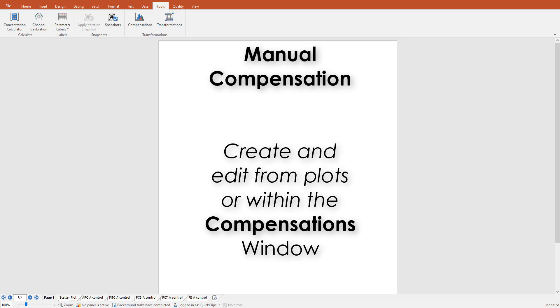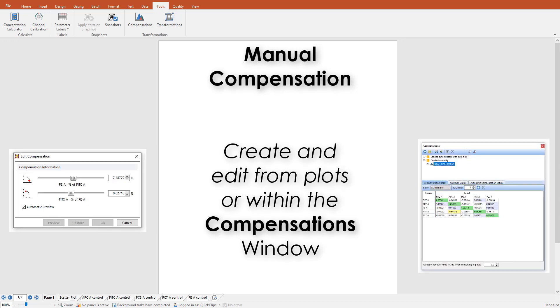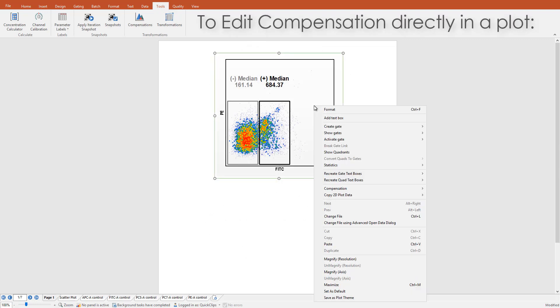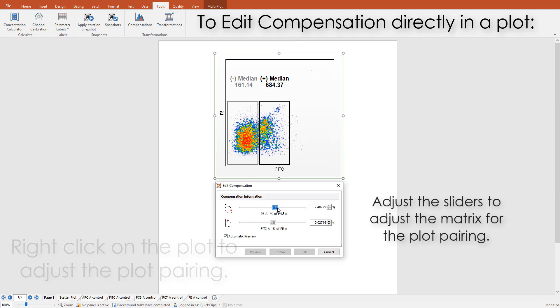A new or existing compensation may be edited manually from plots or by adjusting the cofactors in the matrix. To edit from a plot, right-click, choose new or the existing compensation listed.